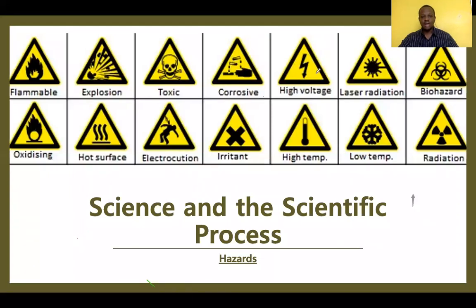This is high voltage, high temperature, and this is low temperature. This is laser radiation, right? And this is radiation, and this is a biohazard. So you see the biohazard popping up, right?